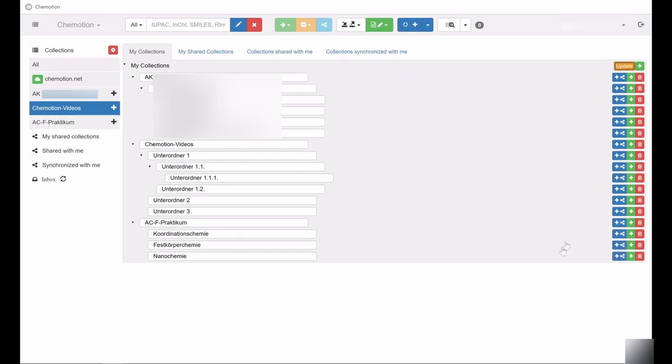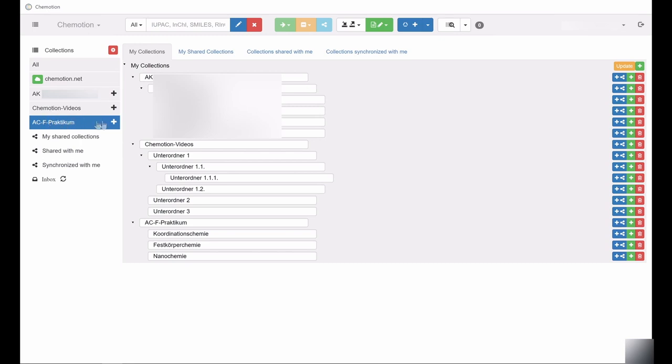If this happens, you will have to repeat all work steps from the beginning. Your updated changes will immediately be displayed in the bar on the left.